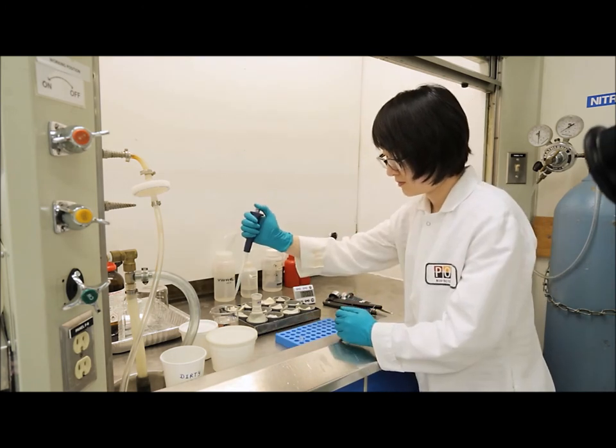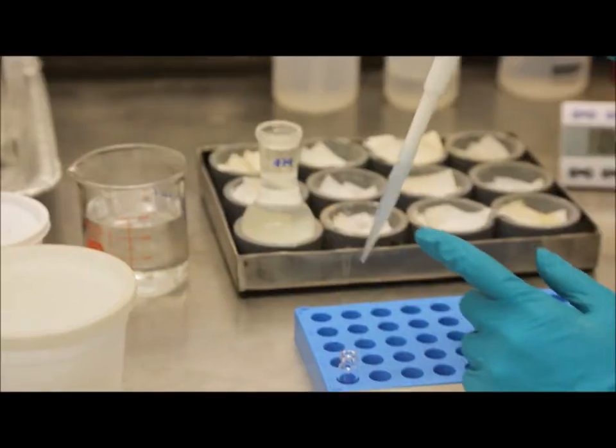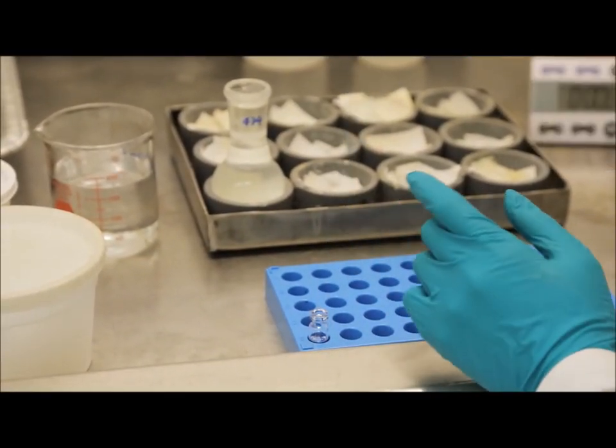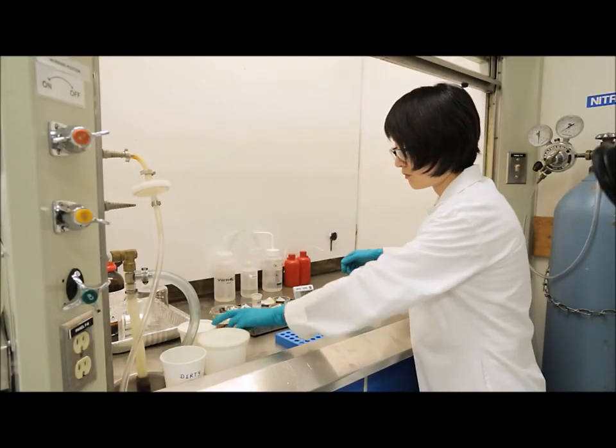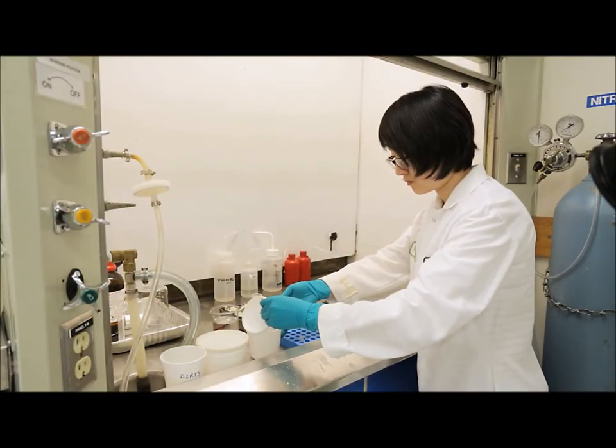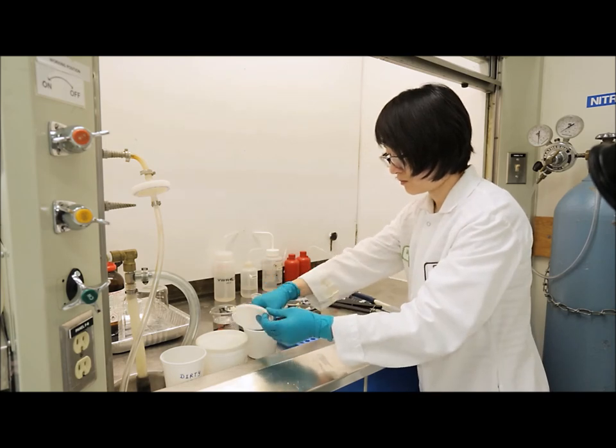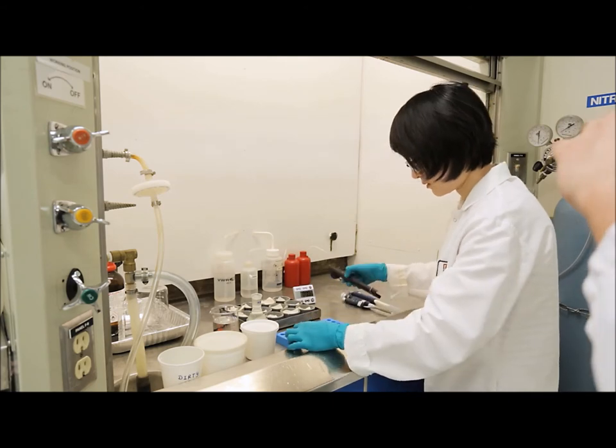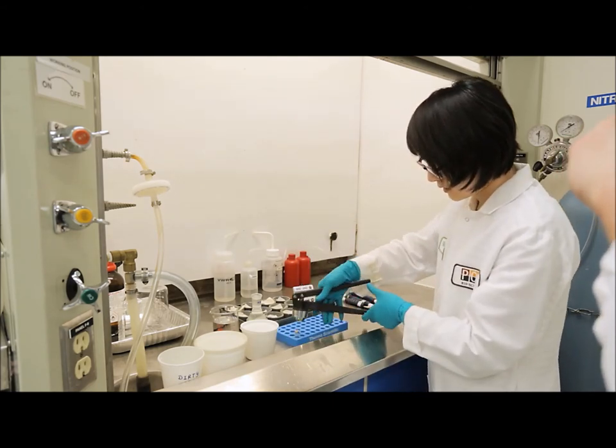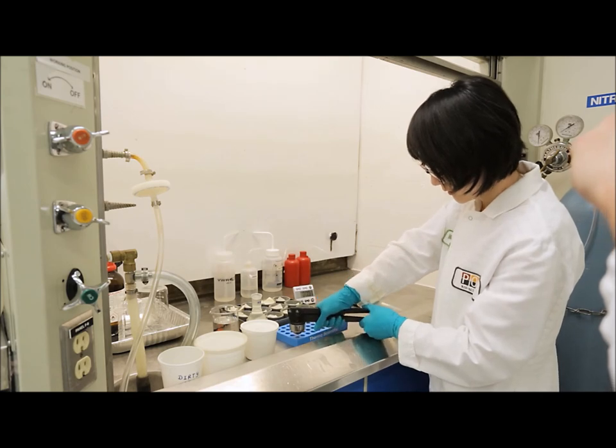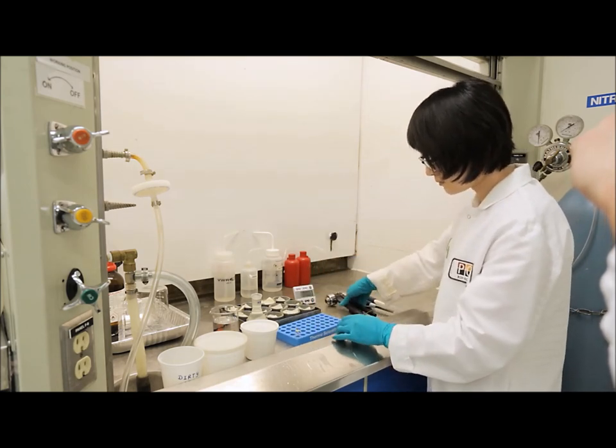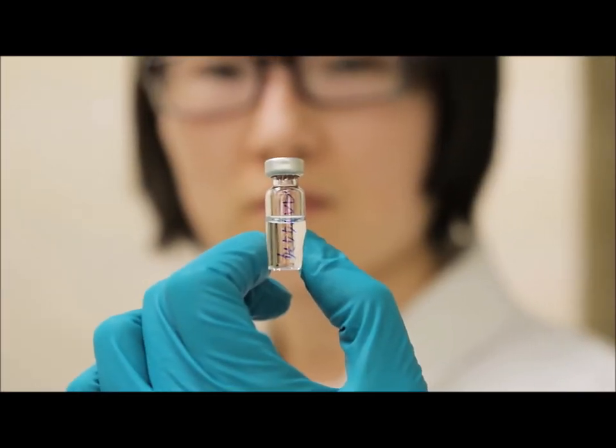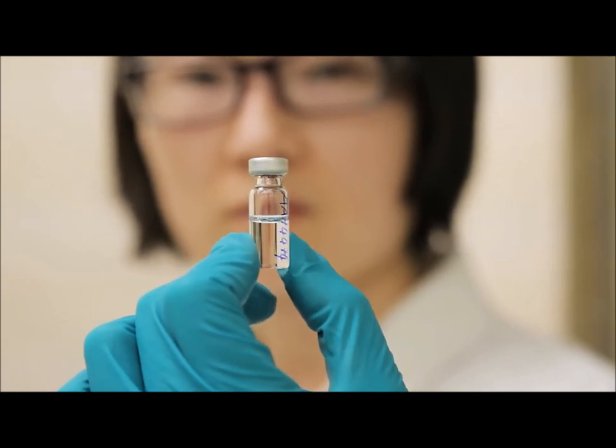Once you've added the heptane layer, the next step is to add one milliliter of heptane to the vial. And after the heptane has been added, we can cap the GC vial. It is important to ensure that the cap is on secure and it's not loose to allow for any of the heptane to evaporate. The sample is now ready to be injected onto the GC.